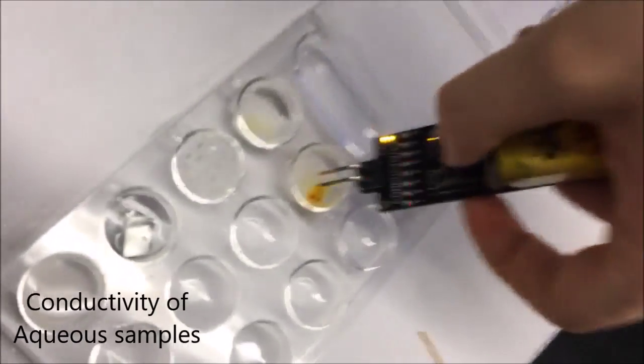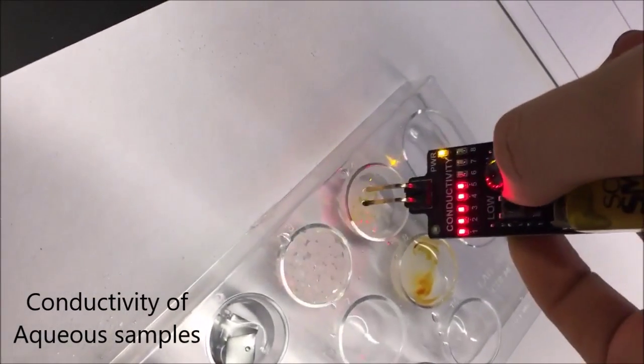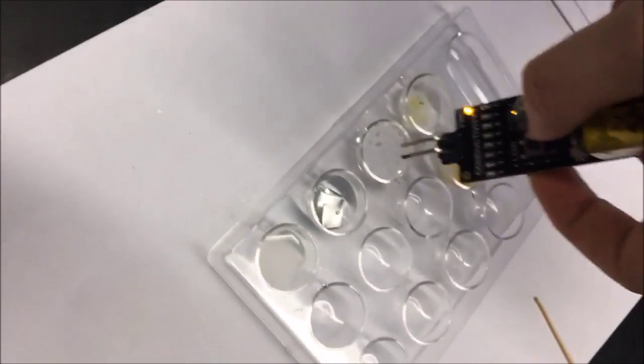The objective of the third and final part of Station 2 was to test the conductivity of the aqueous samples. Both table salt and potassium iodide were conductive when dissolved in water, but sucrose was not.